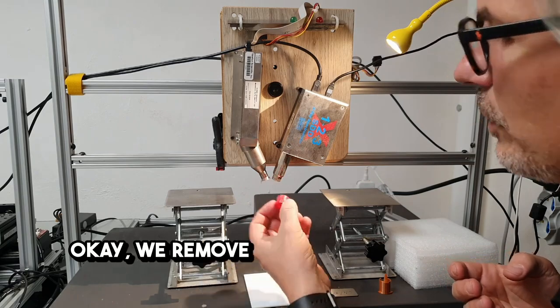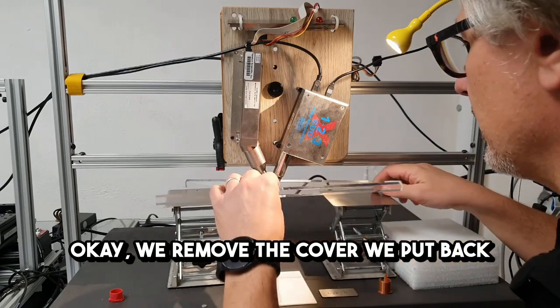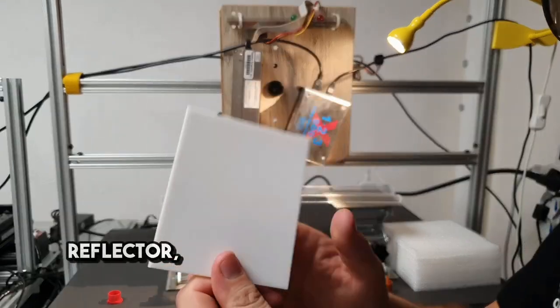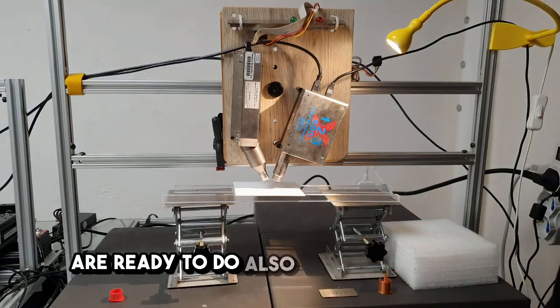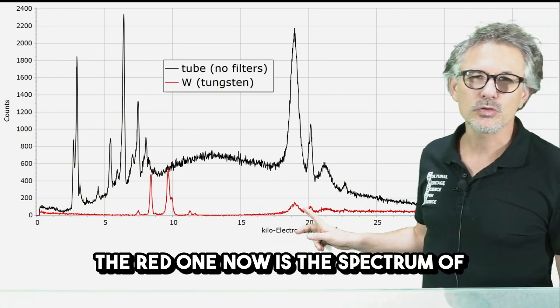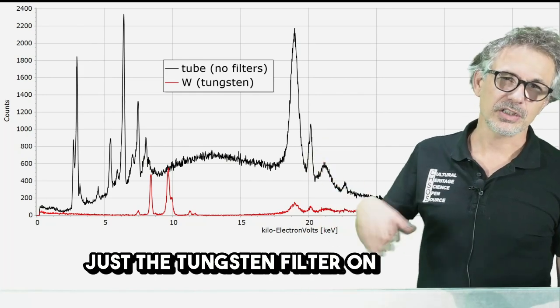Okay, we remove the cover, we put back the reflector, the mirror for the X-ray, and we are ready to do also this measurement. The red one now is the spectrum of just the tungsten filter on the tube.